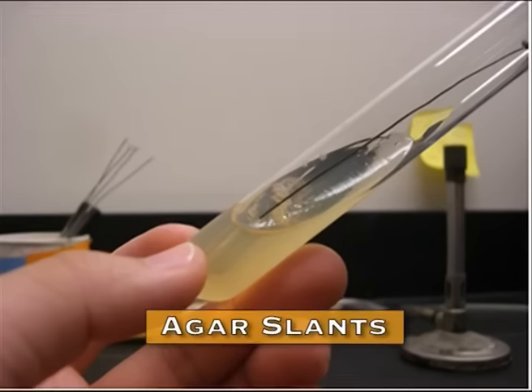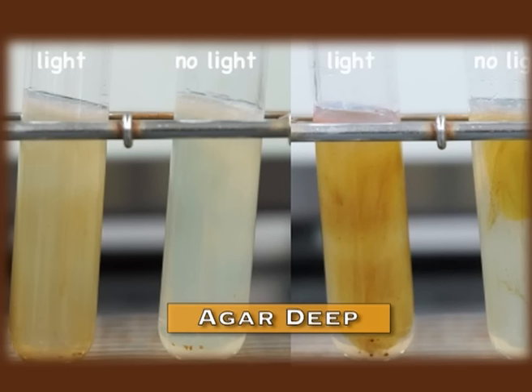If the solid medium is dispensed into culture tubes and hardened in a slanted position, then it is known as agar slants. The slants are generally used for maintenance of pure culture and for biochemical studies of that particular microbe. Whereas the second form is agar stab or agar deep. What is agar deep? Agar, when solidified in an upright position in the culture tube, gives rise to agar deep. It is generally used for the growth and cultivation of anaerobic bacteria.